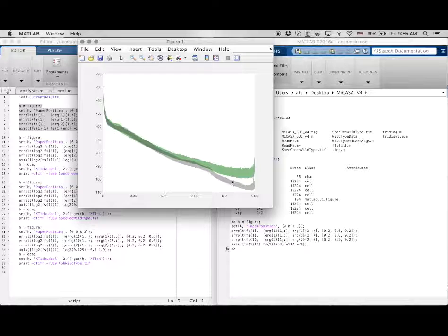Down here they don't match, but this is not on the length scales that we care to look at. This is on the pixel length scale, whereas we're really interested in the cellular length scale and greater. So cellular scales are around 8 microns or so.